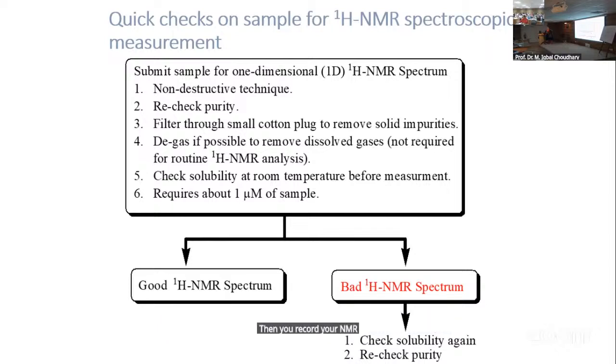Okay, and then 1 Kelvin and 1 Kelvin, you have to wait. So if you want to, for example, decrease or increase the temperature by 5 Kelvin, it will take half an hour or maybe 20 minutes. You just need to have a stable temperature when you record your sample. All right, so you have that much control.